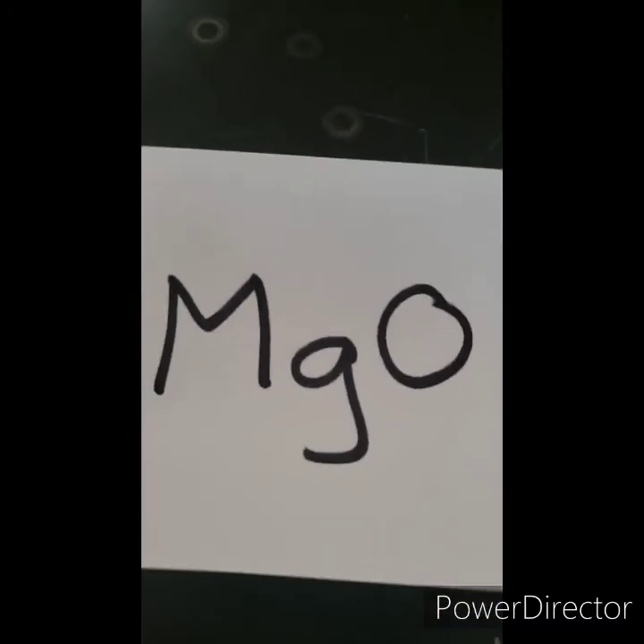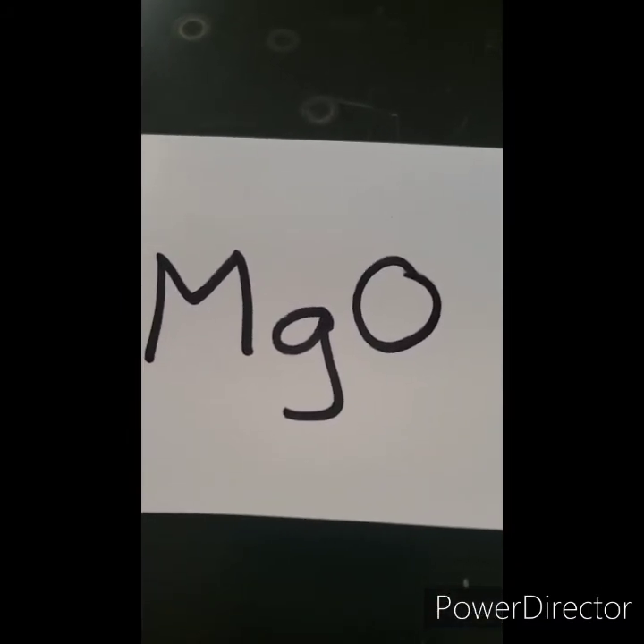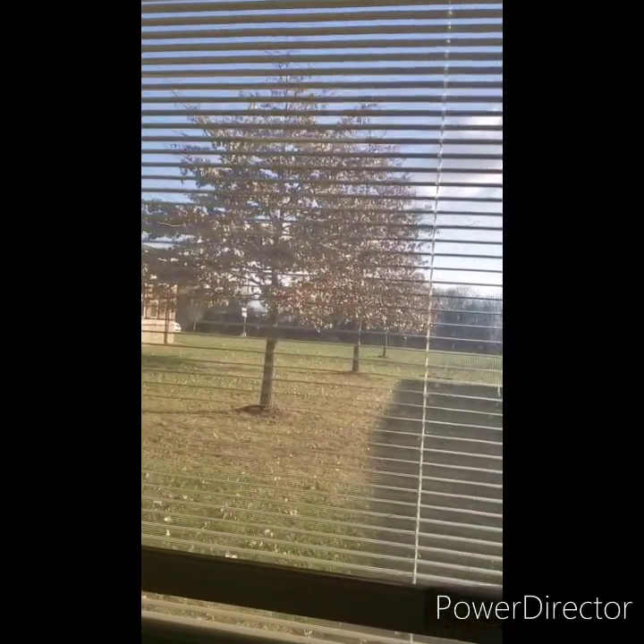Here's a clue — here's a compound: magnesium oxide. And here's what it looks like: pure white, powdery, dull. Here's a view from the laboratory this morning. Hope you guys are having a great day. Bye.